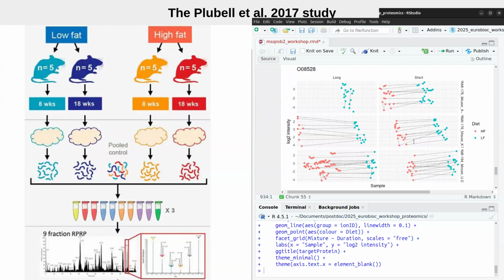First of all, here we can see this mixture, we probably don't have data from one of our conditions, so it only relies on two mixtures. Here you can see there are a few data points, here there are many data points. And whereas here we don't see an effect, here there's a slight effect. So yeah, it's borderline significant, and we can now ask ourselves, is this because of imbalances in the data or not?